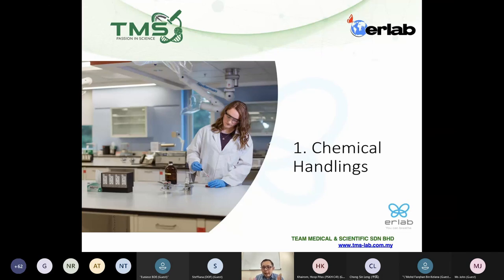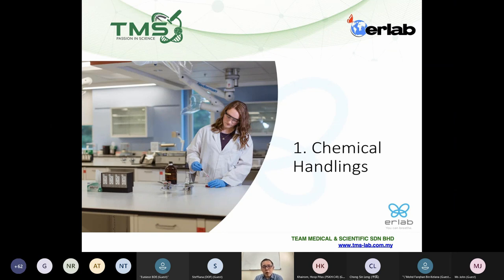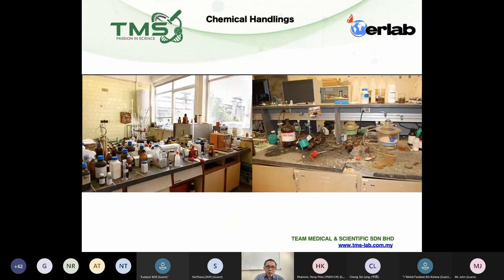Let's talk about the engineering controls that you can use when you handle chemicals. Today we'll talk about two applications: one is chemical handling, and the second one is engineering control for chemical storage.